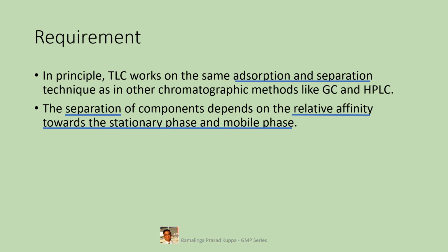Depending upon the chemical structure and polarity of each constituent component of the compound, the affinity varies. The more the affinity, the longer the retention over the stationary phase, and the component tends to move slowly during separation. The lesser the affinity, the faster the elution, because it stays with the stationary phase for less time. It is like a close relative stays longer in your house than your neighbor. It is the affinity or affection that plays here.